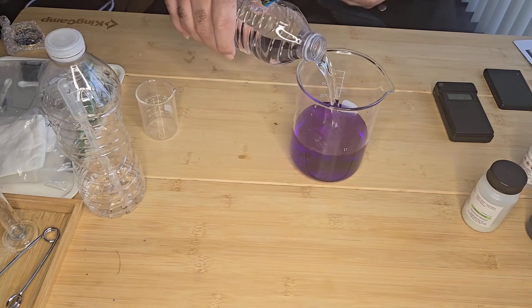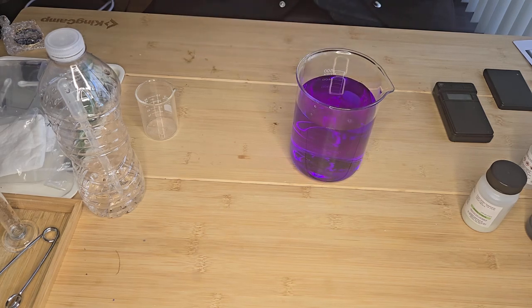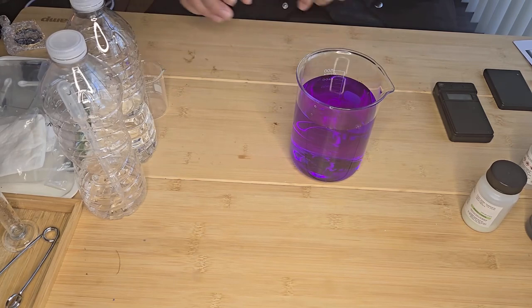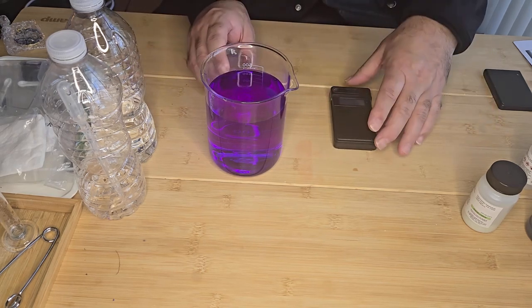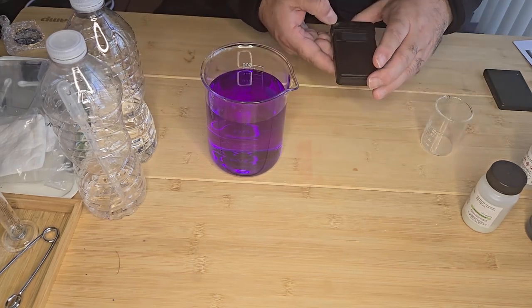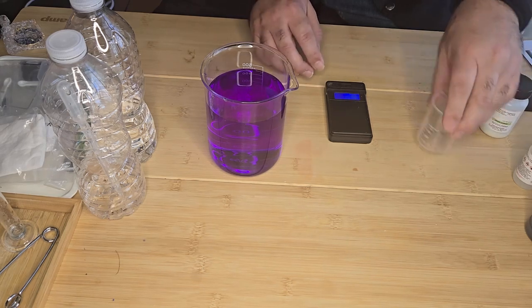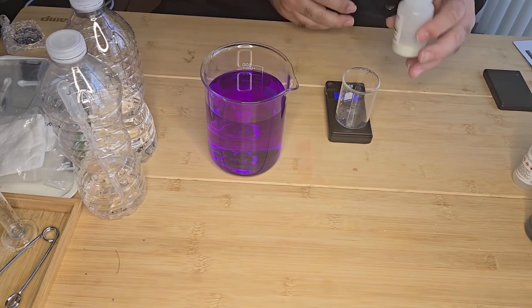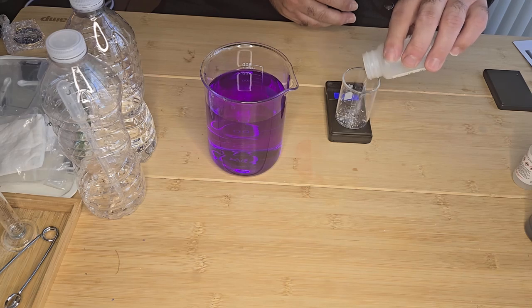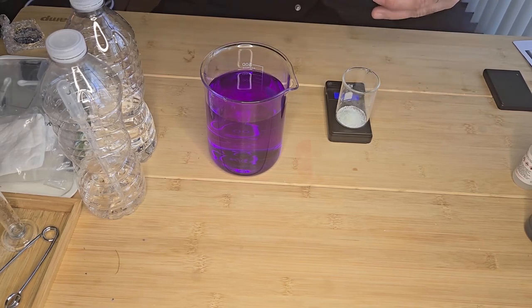Add some more water. Okay, we're at 500. And what I need to do is I want to add 2 grams of iron sulfate. So I'm going to weigh out 2 grams of iron sulfate. And then, there we go, 2 grams.